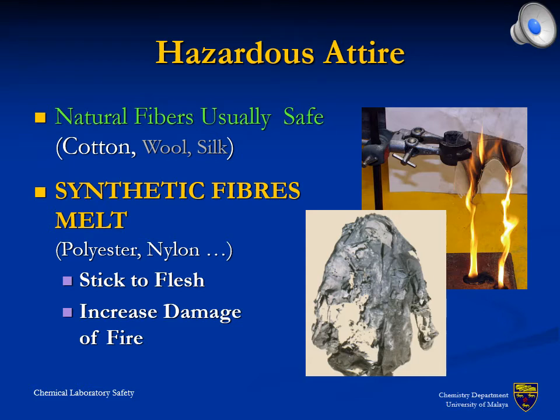The effect of the melting is a shrinking of the fabric and sticking on the body. Synthetic clothes are, therefore, difficult to remove in case of a fire, and enhance the chances for severe body damage. Therefore, synthetic clothes should be avoided inside a chemical laboratory. Particularly the use of head covers and scarves based on synthetic fabrics is discouraged.